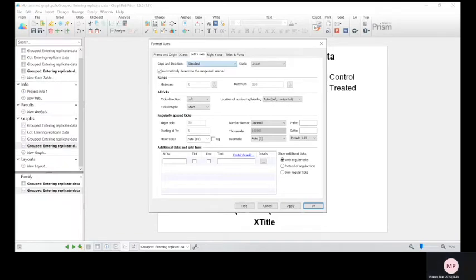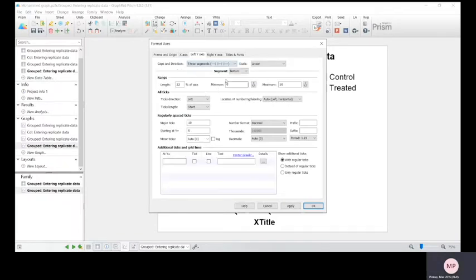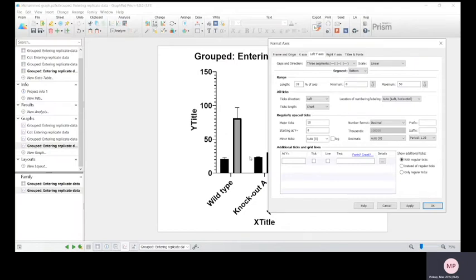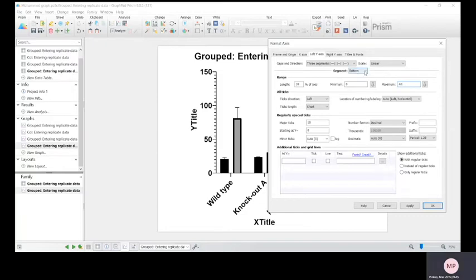Say we want two breaks, so three segments. Click that and you can set your minimum. So the lowest will be zero, and then we want a break around 40.